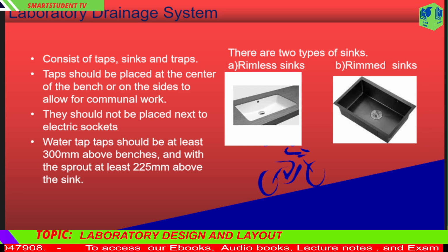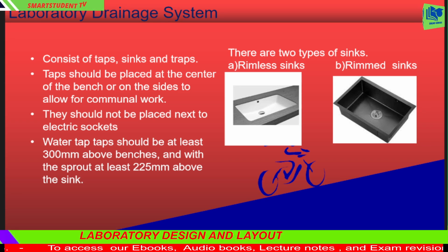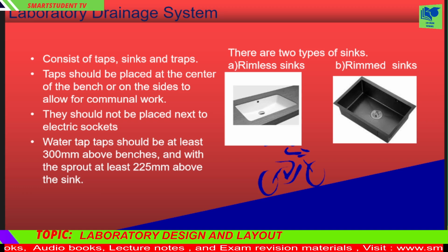The fittings of the sinks should be such that they do not allow leakage or flooding of the water. Rimless and internally rimmed sinks are recommended for use in laboratories because they are easier to wipe dirt from the bench into the sink. The space between the back of the sink and the bench should always be made watertight to prevent seepage.